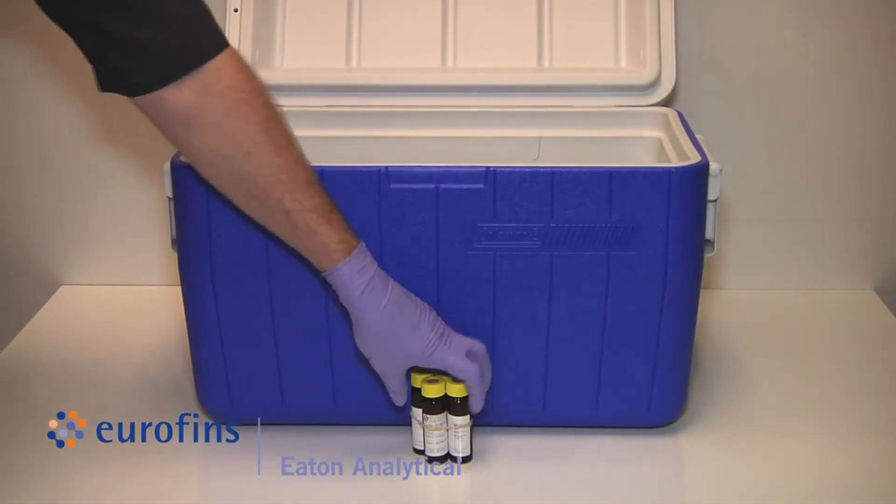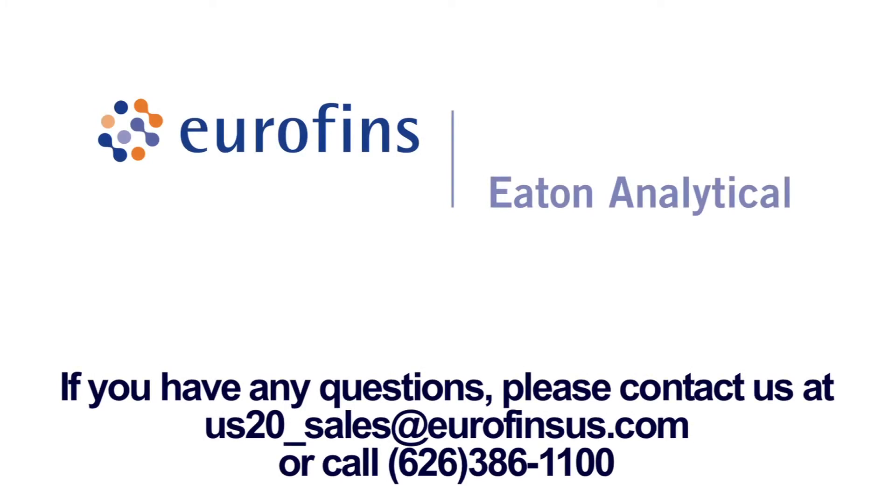Place the filled vials into the cooler and ship back to the lab. Please refer to Eurofins Eaton Analytical's written sampling instructions for specific details.